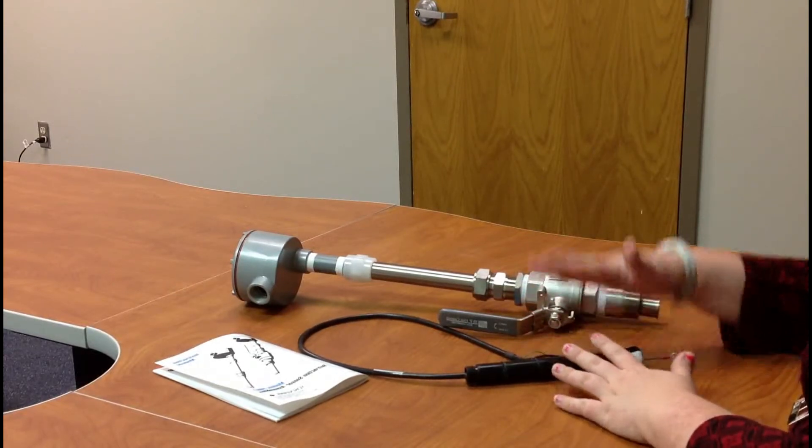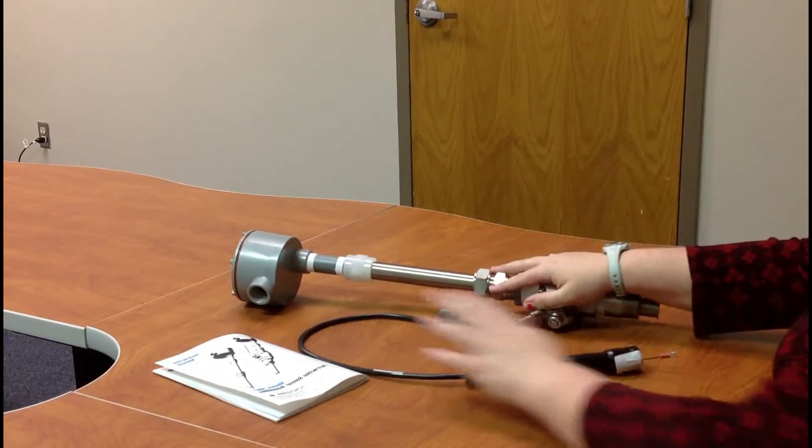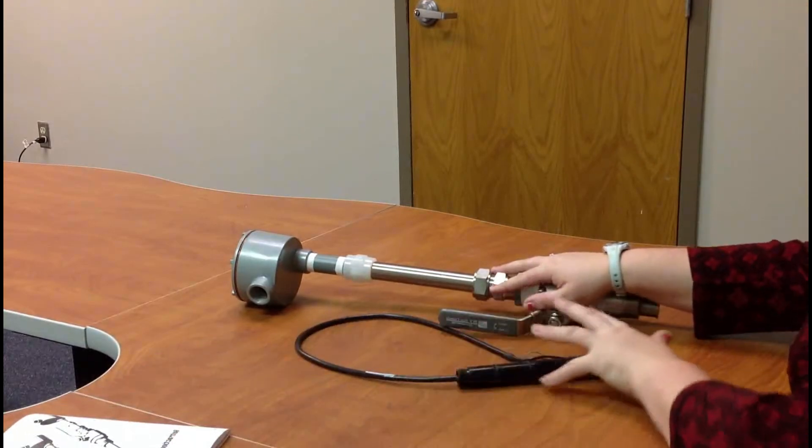So you need to take everything out of this box. You got your 87, it comes with the instruction manual. Your 97 comes with an instruction manual as well.